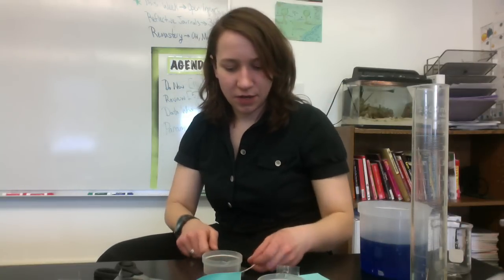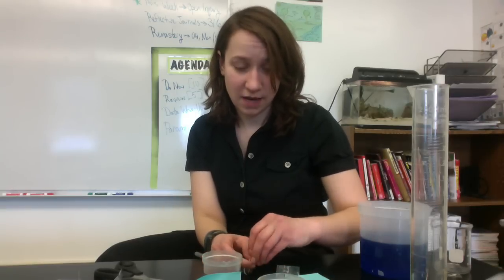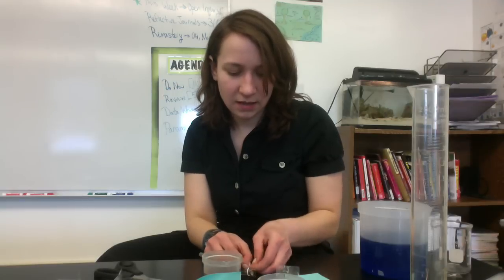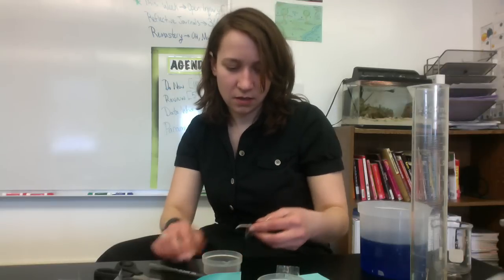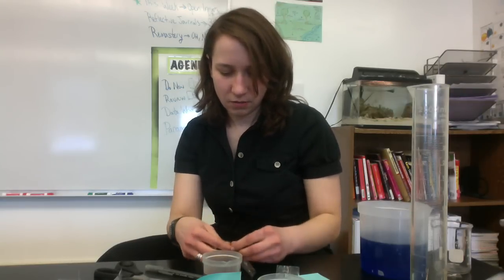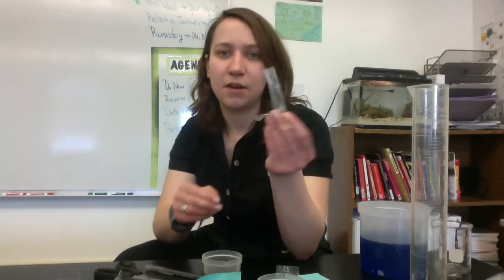You're going to take a piece of string and tie off one end of it. You want to tie really tight so that none of the solution that we're going to put inside can leak out. So there's my tubing tied really tight.